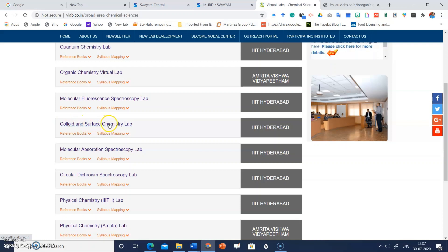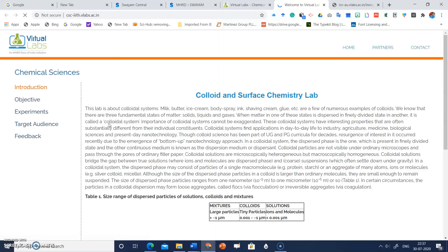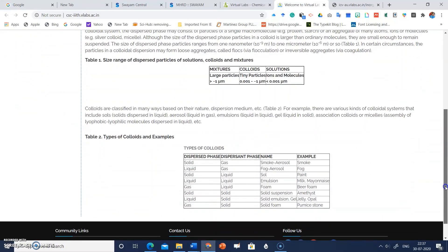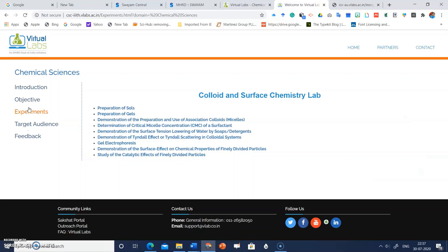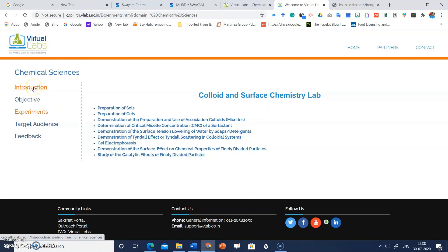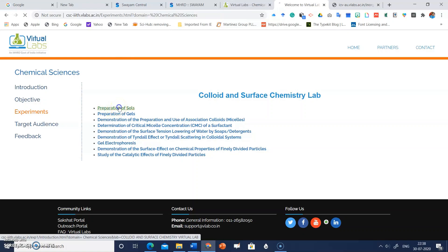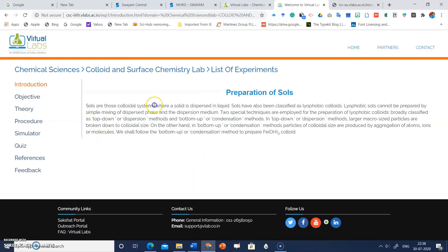Let's explore another virtual lab experiment. Click on 'Colloid and Surface Chemistry Lab.' When you click on it, the colloid and surface chemistry lab page will open. Click on 'Experiments.' You can also see the introduction, objective, experiments, target audience, and feedback sections.